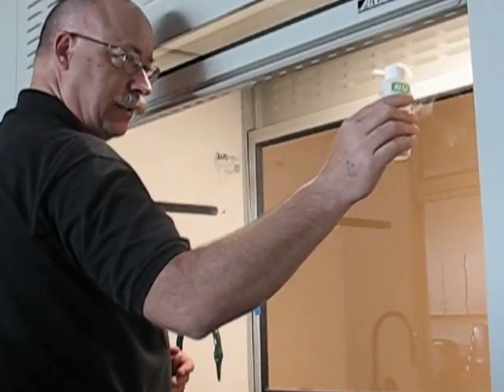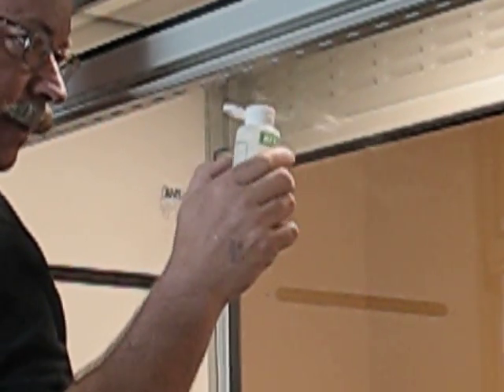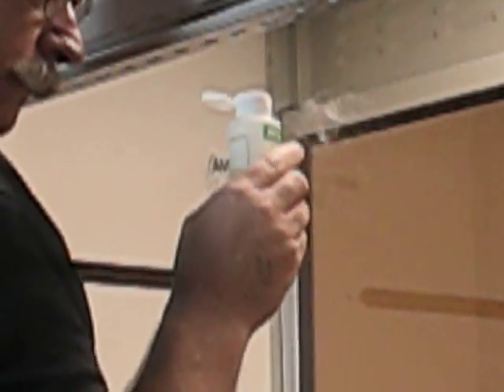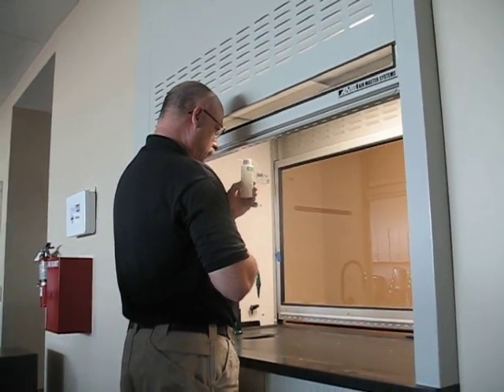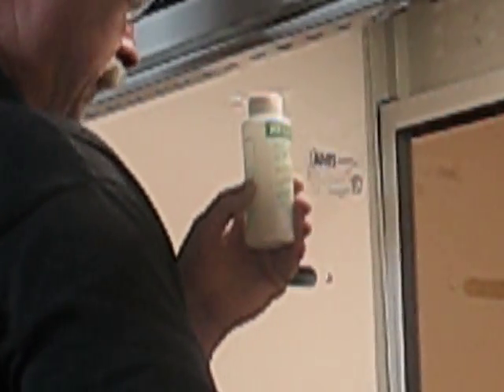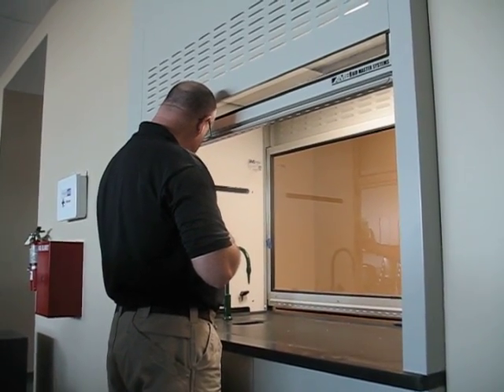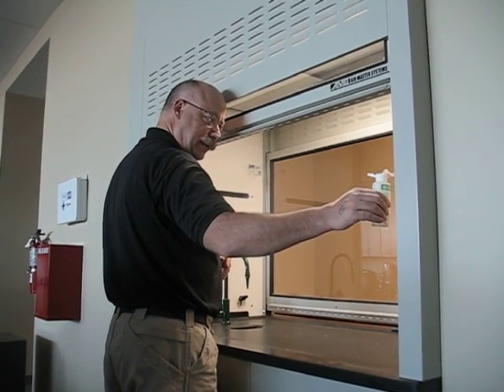I'm going to watch where the ventilation fume goes. In this particular case, I see that it's migrating reasonably well into the hood, into the cavity of the hood, until I get directly in front of me where I'm creating a low pressure zone, and I see that it stalls, still going into the cavity of the hood, however. And I continue to smoke across the face, gently blowing out the tracer fume.